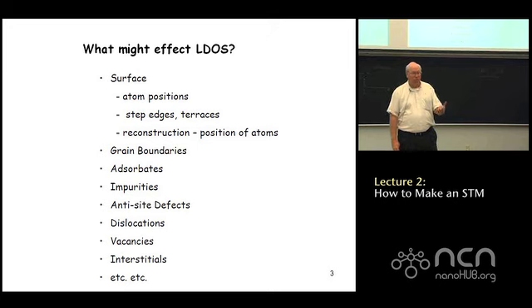So this is particularly an interesting question with regard to few-layer graphene, because we're doing scanning tunneling microscope studies of few-layer graphene. We're seeing features on the surface, but we don't really know if those features are localized on the surface or whether they're related to perturbations in the few-layer graphene, maybe 1 or 2 layers down. We certainly know in few-layer graphene we can see 1 layer beneath the surface. It's a fair question whether you can see 2 or 3.